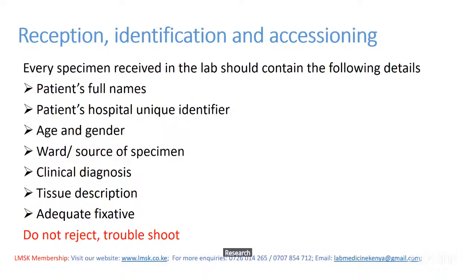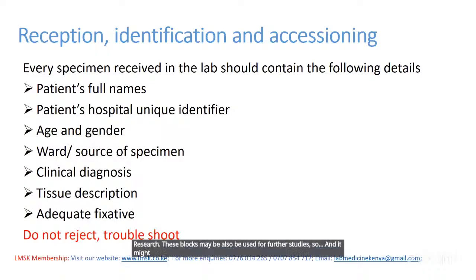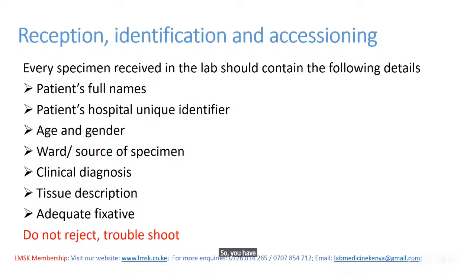These blocks may also be used for further studies, and it might be even more than 5 years later. So the year is very important. You have to accession according to the procedure. Every lab should have an SOP on how they accession their samples.